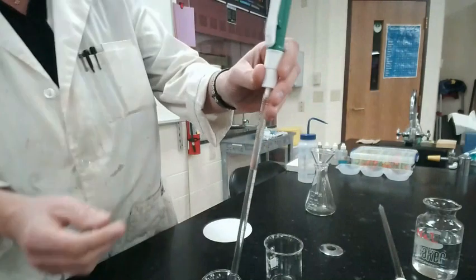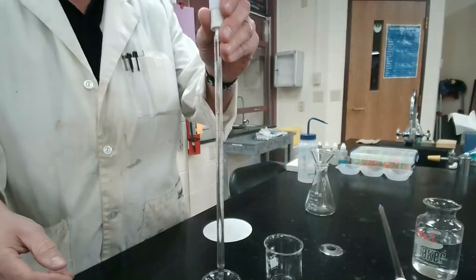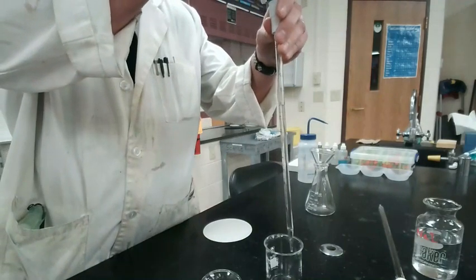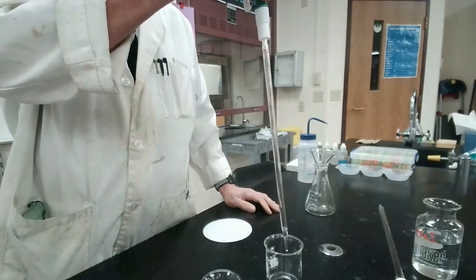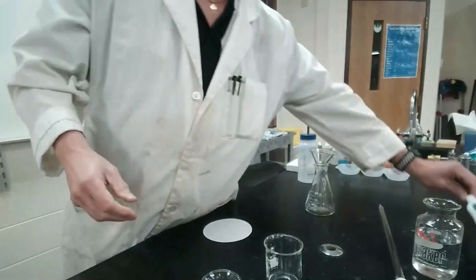I'm back. Now I have exactly 10 milliliters of lead nitrate in this container. I'm going to put it into a beaker. I just hold this until it all goes into the beaker. All right, now I'm done with that.